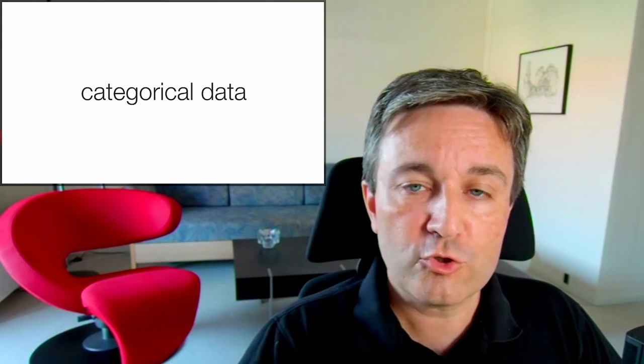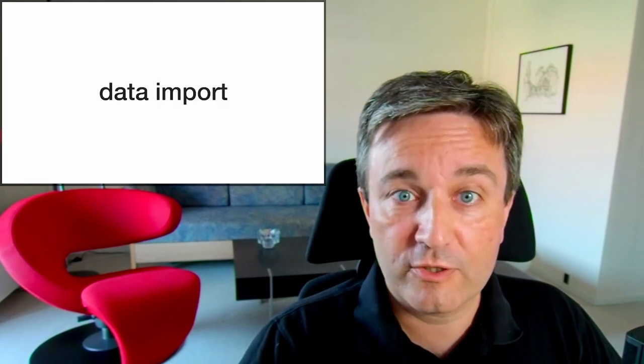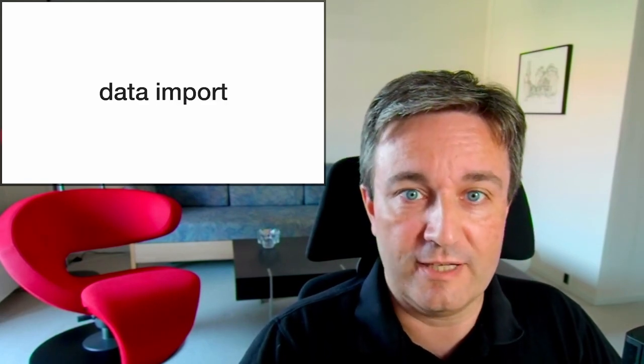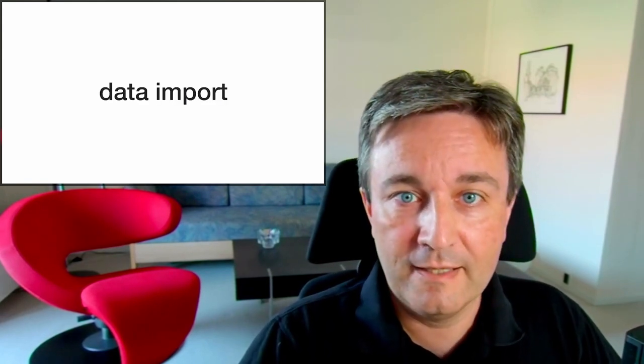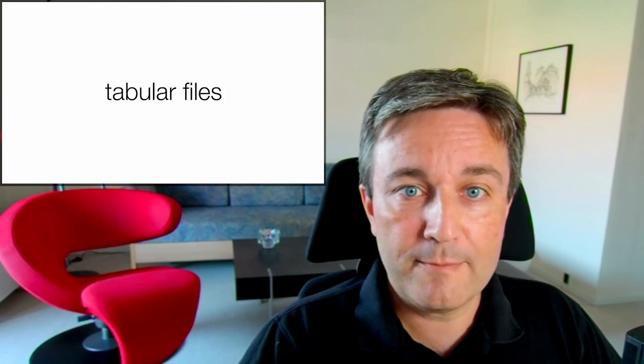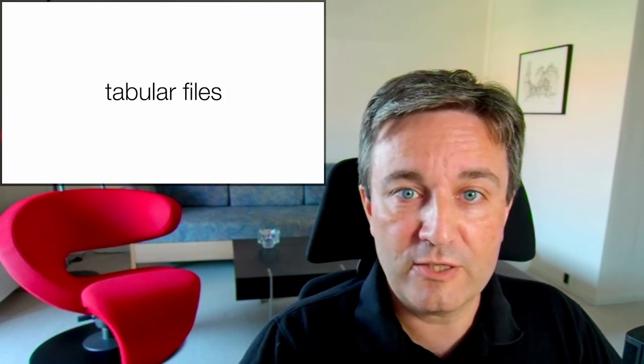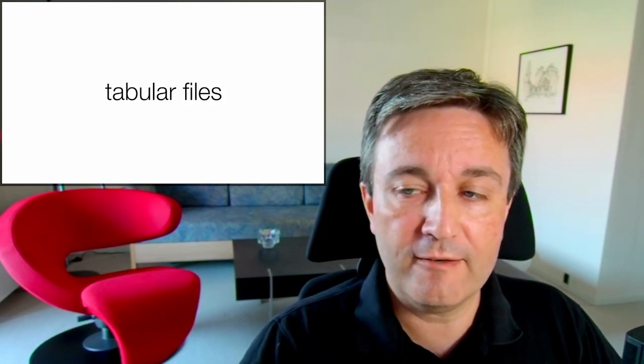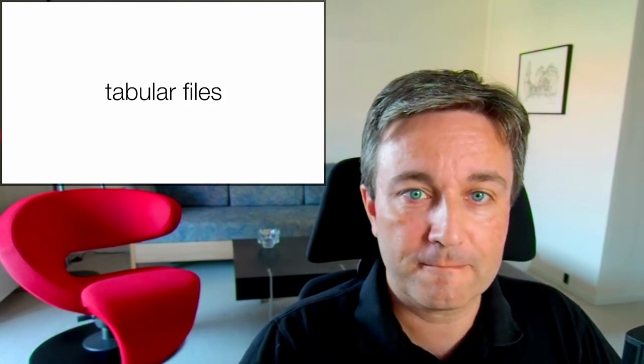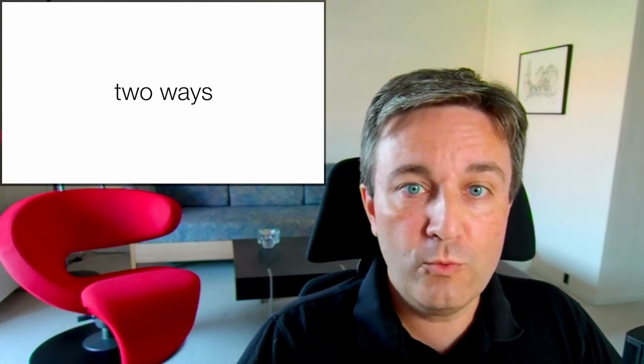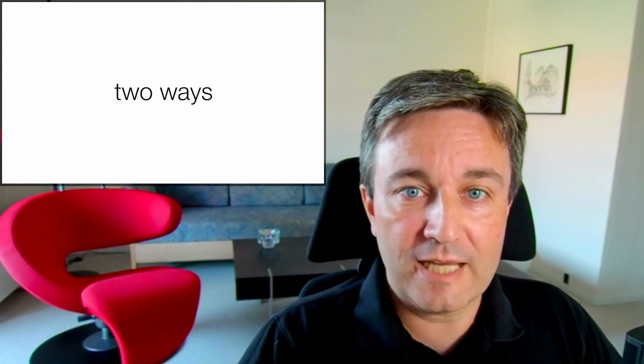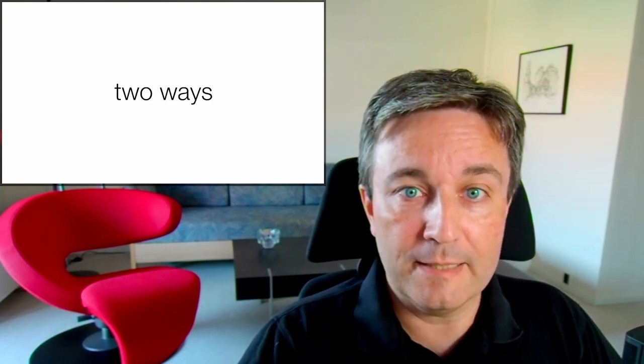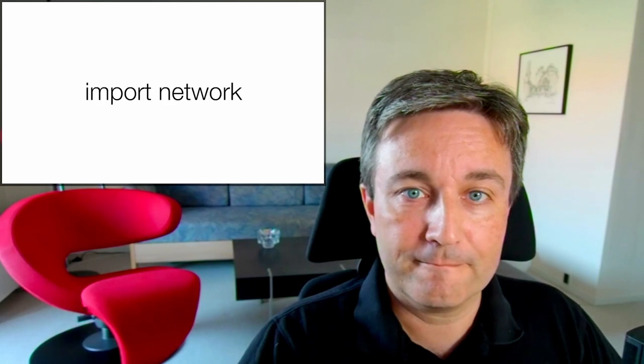Of course, to use all of this, you need to first get your data into Cytoscape. Cytoscape is able to import a wide range of tabular file formats, including spreadsheets.